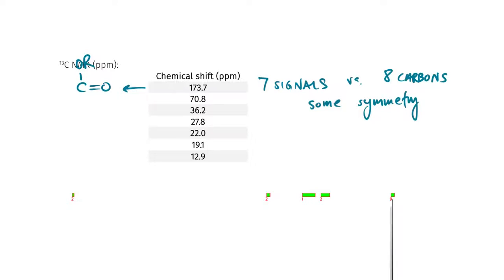I think the key for spec ID problems is get a few pieces of information from every spectrum, the lowest hanging fruit first, and try to assemble the structure. If you run into problems, then maybe look a little bit deeper for more detail. Because the danger with the detail is if you have wrong assumptions, you can go down the rabbit hole really quickly and run out of time. Okay? Any other questions about carbon? And you're free to go back to your spectra as you go along. Okay? We're going to move on a little bit right now.